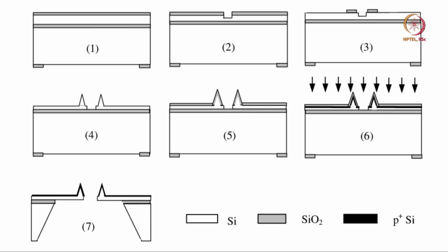This is another process where you can have multiple tips simultaneously. This is an SOI wafer. SOI stands for silicon on insulator.